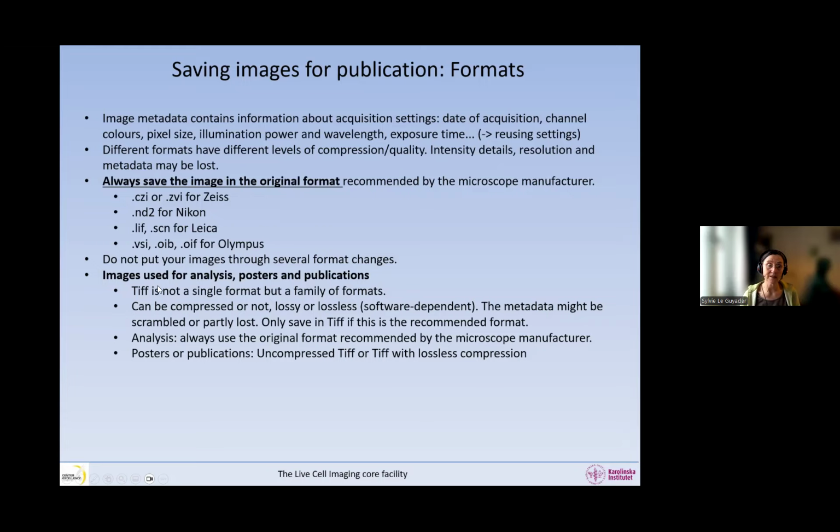It's a great format in the sense that it keeps the quality of the data, but you're not sure about the metadata. And today we have seen that there were some images that were saved from a Leica microscope in TIFF, and most of the metadata was gone. And even the metadata that was there was actually wrong as well.